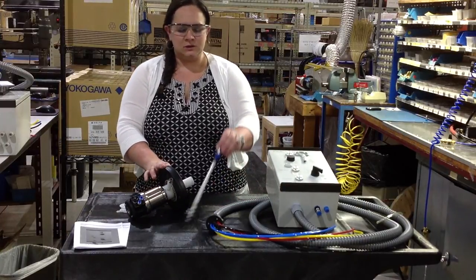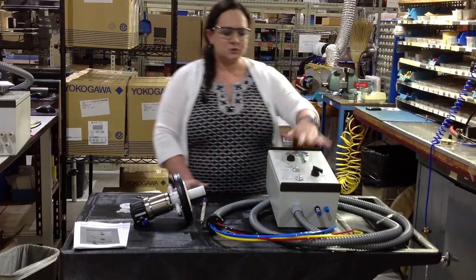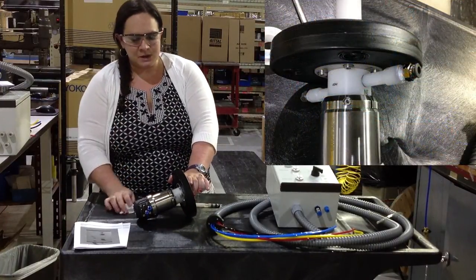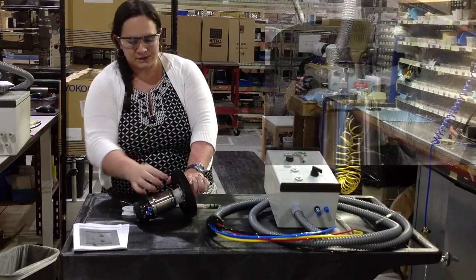You need a pneumatic retractable, you need a 225mm probe that's got a PG-13.5 connection, and you need some sort of control unit, whether it's manual or automatic. You also need some Teflon tape, a wrench, and some quick disconnect tube fittings. We've already installed them here.